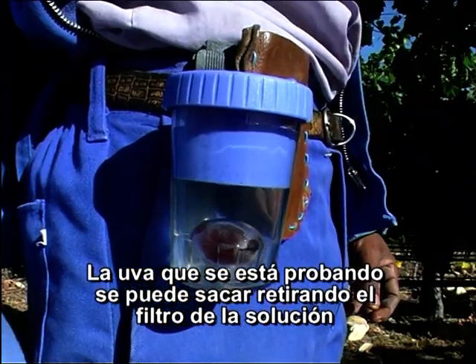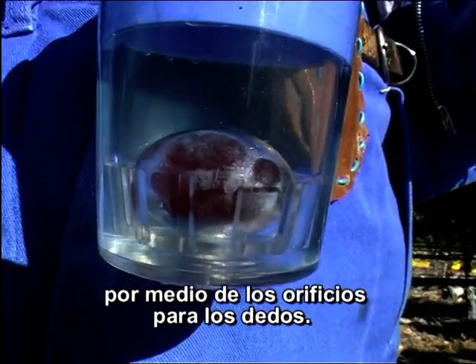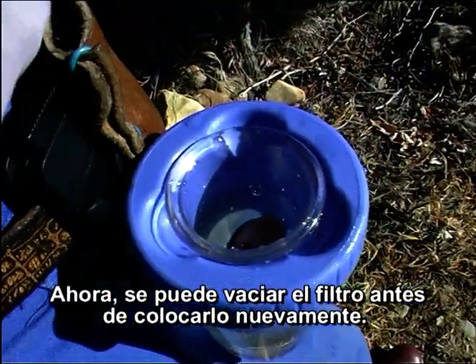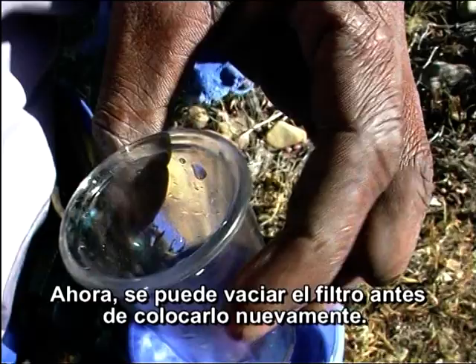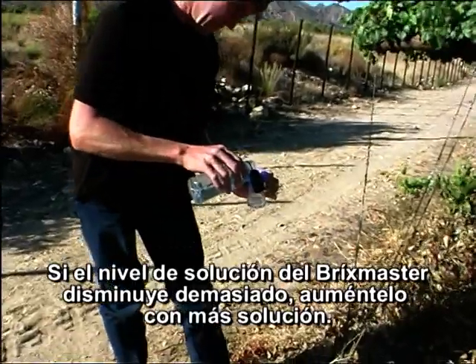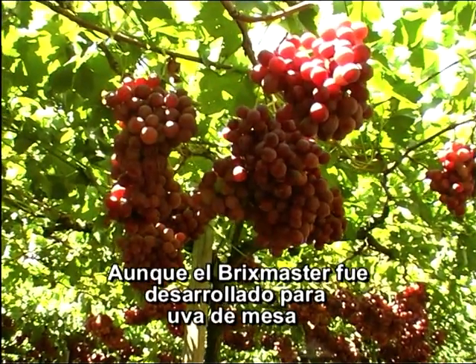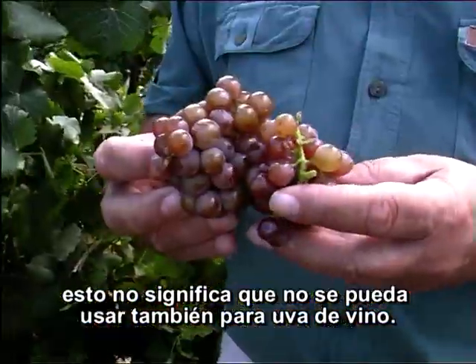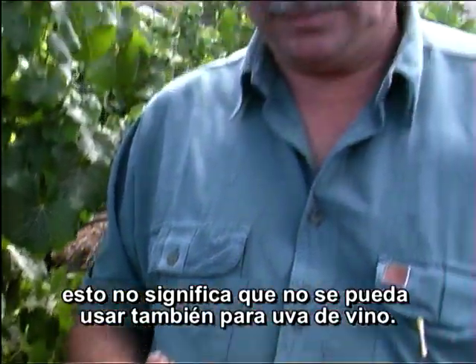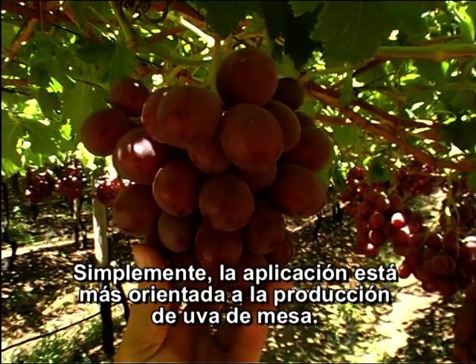The grape under test can be removed by taking the strainer out of the solution using the finger holes. The strainer can now be emptied before replacing it again. If the solution level in the Brixmaster drops too low, top it up with new solution. Although the Brixmaster was developed for table grapes, this does not mean it cannot be used for wine grapes as well.